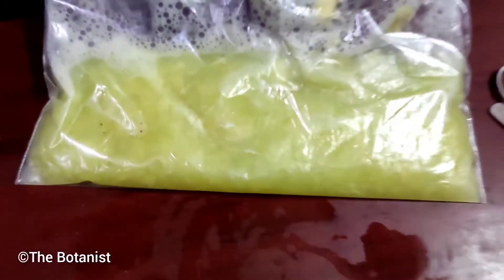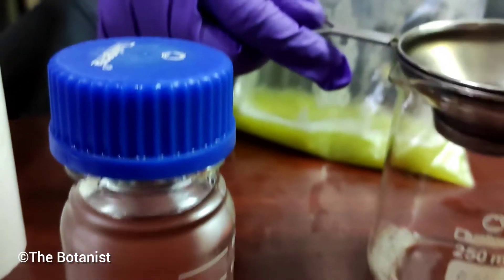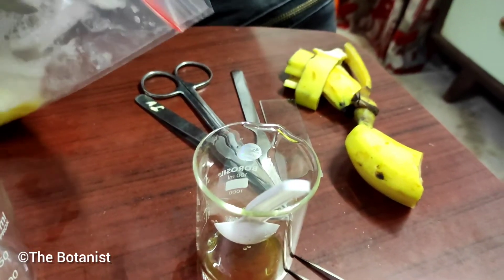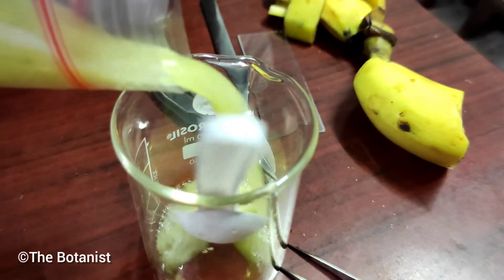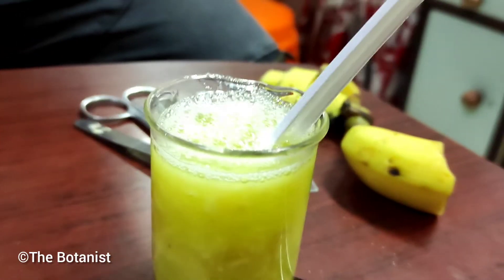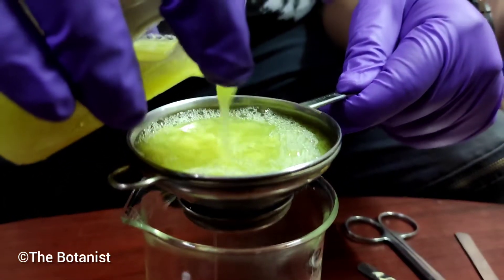We are separating the dissolved part and taking the filtrate in a beaker.